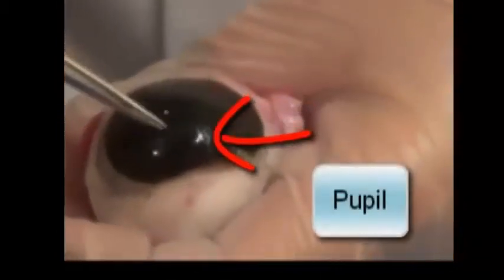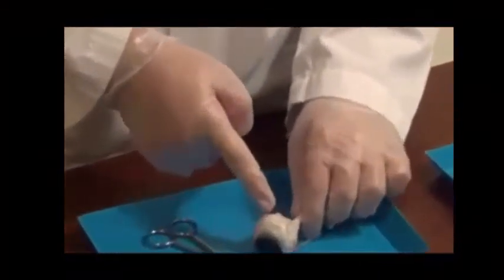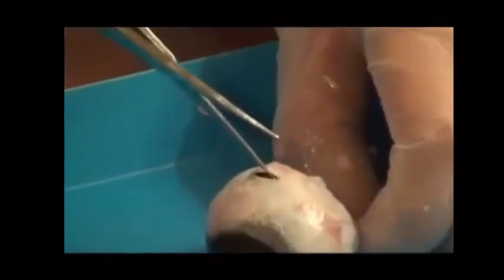The hole in the middle of the eye is the pupil. It expands and contracts according to the amount of light — if more light is put through, the pupil contracts. Now we are going to begin the dissection by removing the fat around the eye so we can see the optic nerve more clearly. Then we will pierce the sclera and cut along that hole to observe the internal structures of the eye.